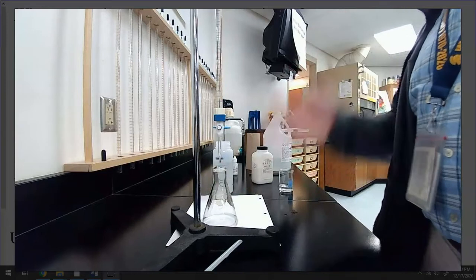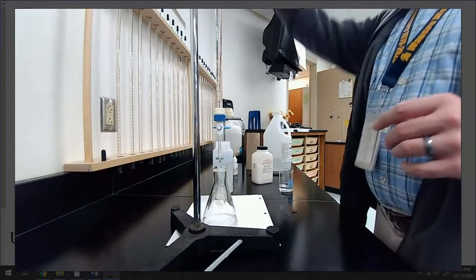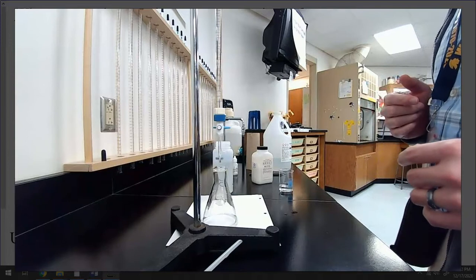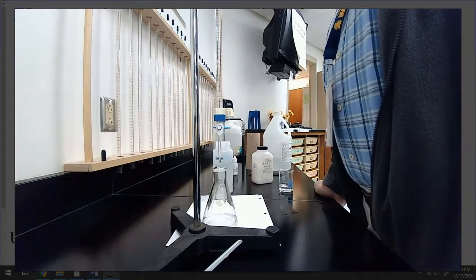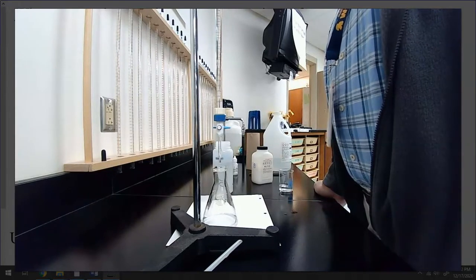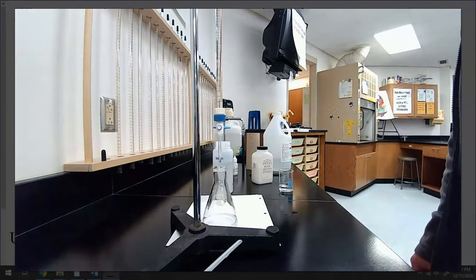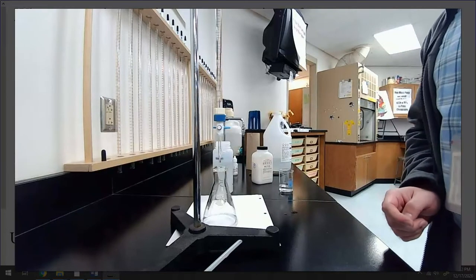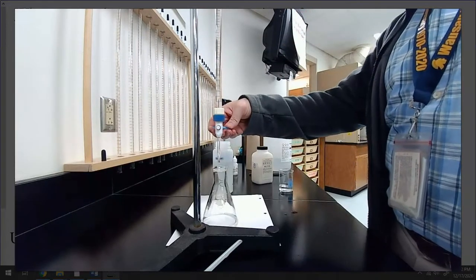All right, so I got my acid in the flask, I got my base in the burette, I'm ready to go. First things first, I need to record and write down my starting volume, because I need to know how much base I add in order to solve this problem. So let's do that. Let me read this. I am starting with 3.79 milliliters as my starting value. You should record that, much like you should record the 0.506 grams of solid acid. Okay, we need both of those numbers to solve this. So I'm starting at 3.79 milliliters. Let's get this thing going.